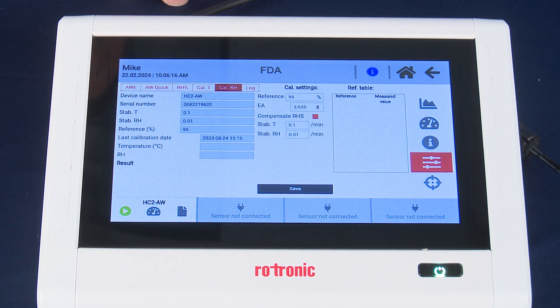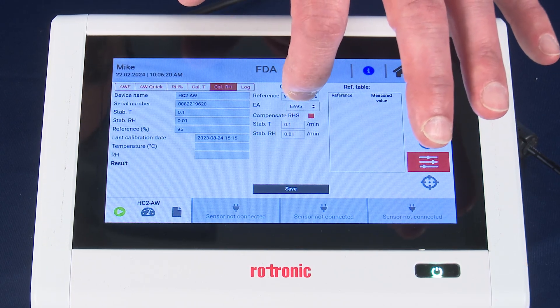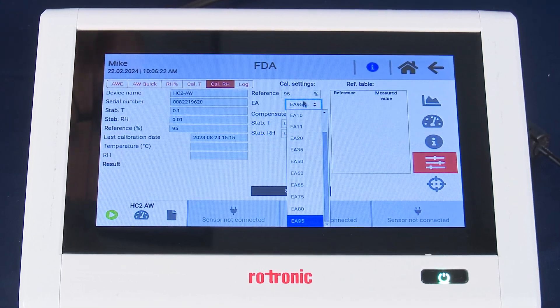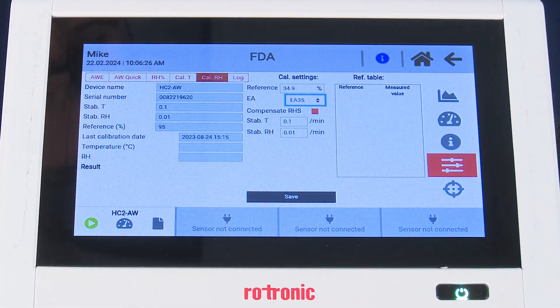It's important now to select the humidity standard that you've chosen. In this instance we've chosen 35% RH, so from the drop-down menu we're going to select that. You want to be sure that the temperature stability is set to 0.1 and the humidity stability is set to 0.01.